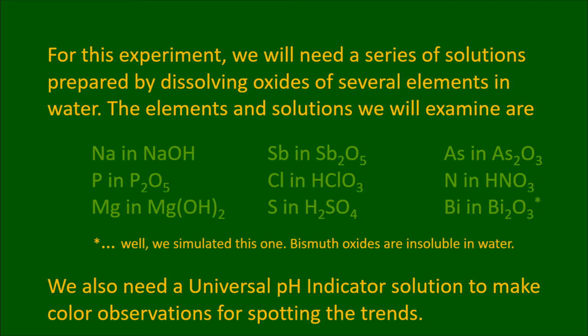The elements and solutions we will examine are sodium in sodium hydroxide, antimony in antimony 5-oxide, arsenic in arsenic 3-oxide, phosphorus in diphosphorus pentoxide, chlorine in chloric acid, nitrogen in nitric acid, magnesium in magnesium hydroxide, sulfur in sulfuric acid, bismuth in bismuth 3-oxide. Well, we simulated this one. Bismuth oxides are insoluble in water.